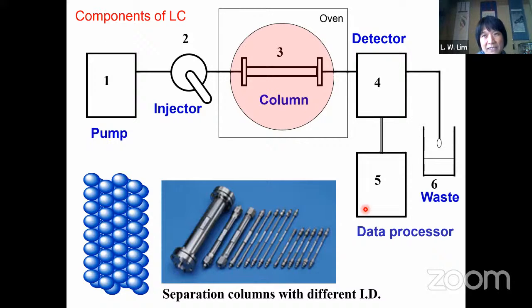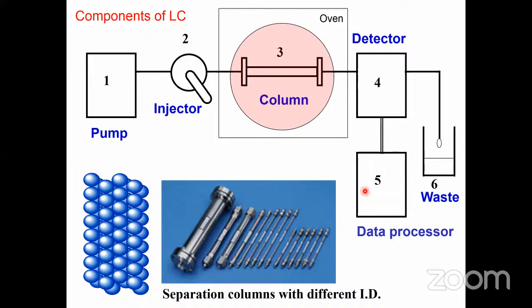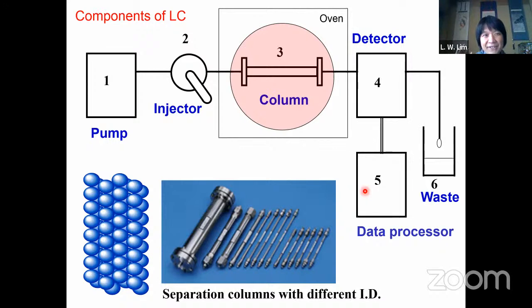And sometimes if you buy one license, you can use it for 2 detectors. In this case, we call it 2-channel. That's why when you buy your software, it is important to ask whether this software is for one single channel or 2 individual channels.